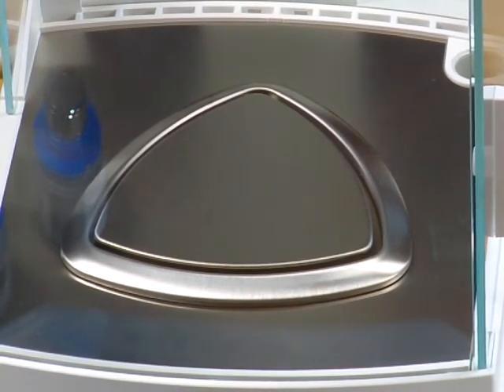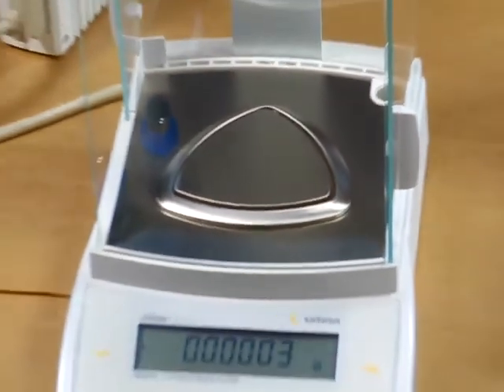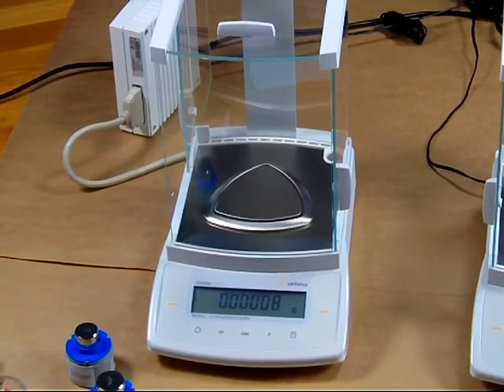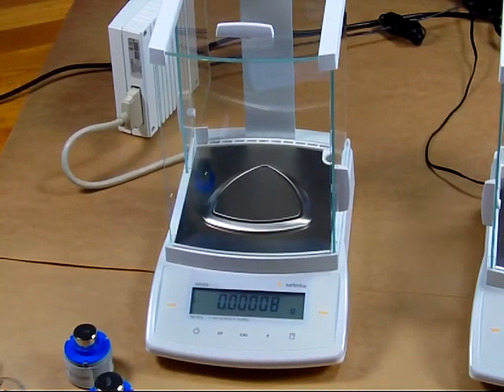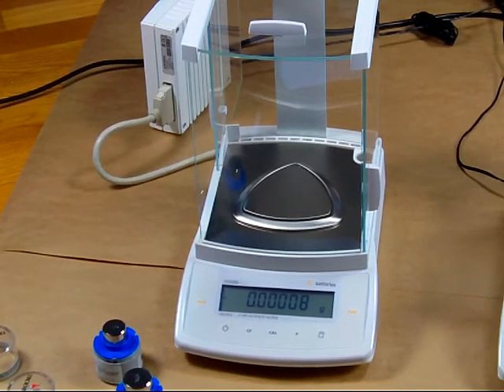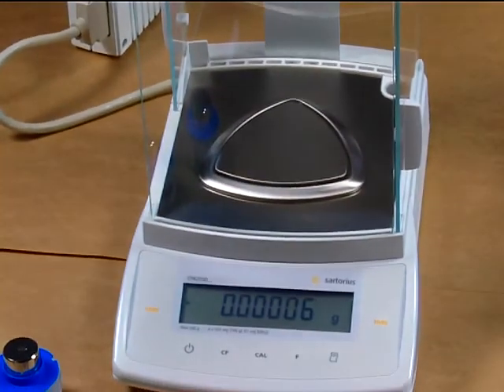Sartorius comes with a 3 year limited manufacturer warranty. It also has ISO-Cal, a feature that automatically ensures the balance is calibrated, doing automatic adjustments at regular intervals or when there's been a temperature change. The Sartorius CPA225D — we try to keep this in stock at all times. Presently we have about 4 pieces on the shelf and it's a spectacular value. Thank you.